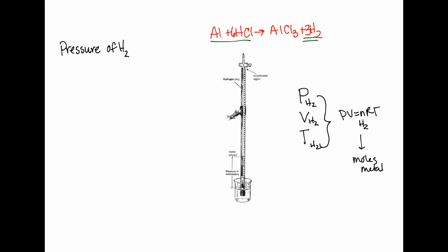And if that's true, the pressure of the gas, so the hydrogen gas, or the gas trapped in the burette, is pushing down, and atmospheric pressure is pushing down on this water here. And if they aren't pushing down the same amount, these two water levels aren't going to be the same. Now you might get lucky, and they will be the same, but that doesn't usually happen in lab. So what we do is we measure atmospheric pressure, so we get that from the barometer.